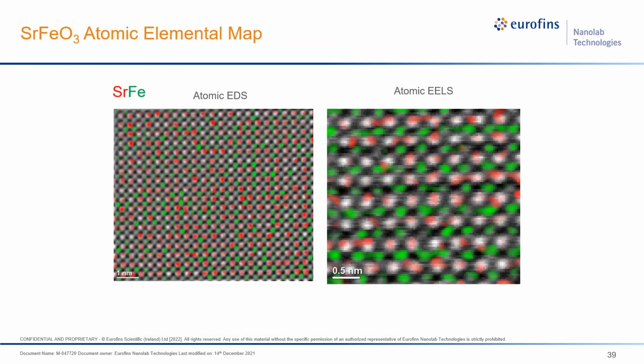And also, we can do atomic elemental mapping for strontium ferrite. Here is an example.